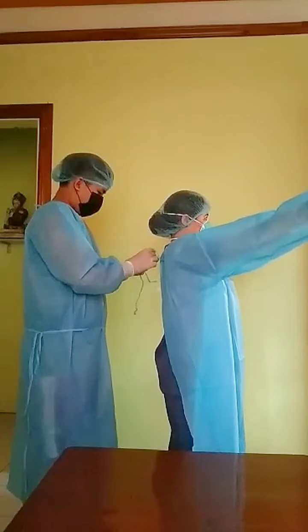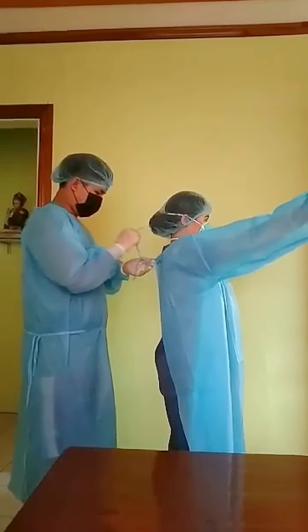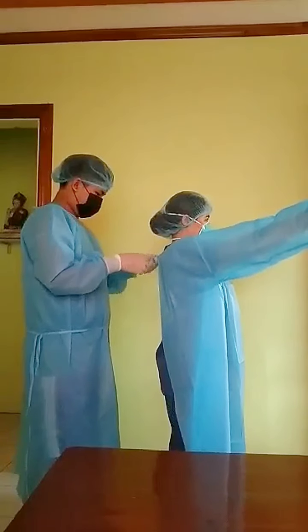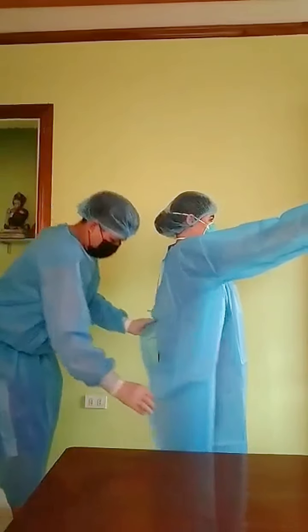The circulator ties the gown at the back, down at waist level. This technique prevents contaminated surfaces at the back of the gown from coming in contact with the front of the gown. While doing so, make sure that the skin surface is not exposed.